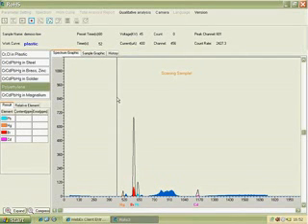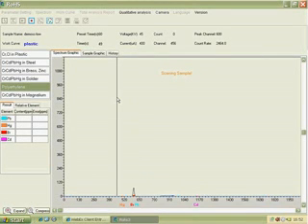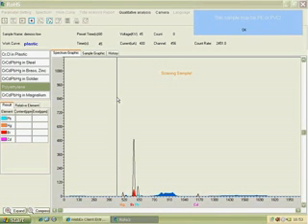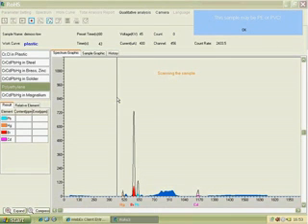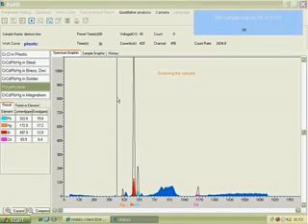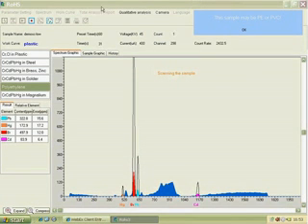My specific recommendation for these machines is to make the sample name not too long, but long enough so you know exactly what part it is that you're looking at for a given customer, because you want to be able to come back to it with that timestamp and say this is what we've run for you — including the specific lot number.